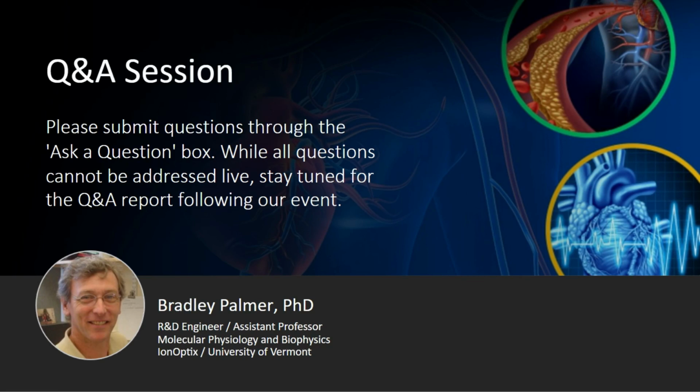There may be occasions that, as they've shown in those other laboratories, if there was an infarct, for example, there would be a buildup of collagen that might prevent the propagation of an action potential across the entire slice. That does occur, but if you've got an otherwise normal or uninfarcted heart, I think you could expect it to get completely activated. Okay.